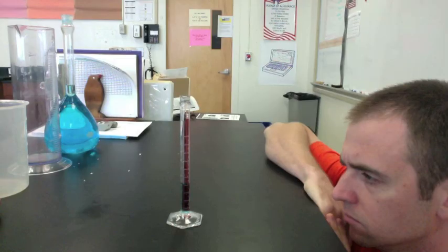With the graduated cylinder on a level surface, and you looking from eye level at the lowest point of the meniscus, it's time to take your reading. Use your scale and count the number of lines up or down from a point that you know.